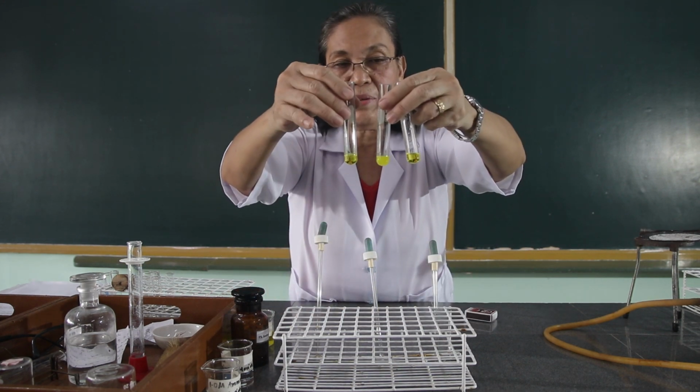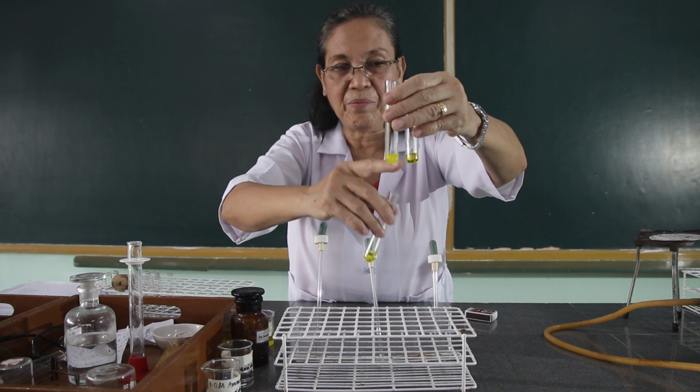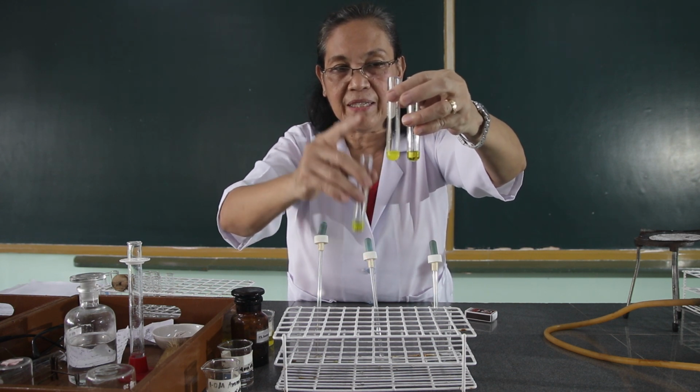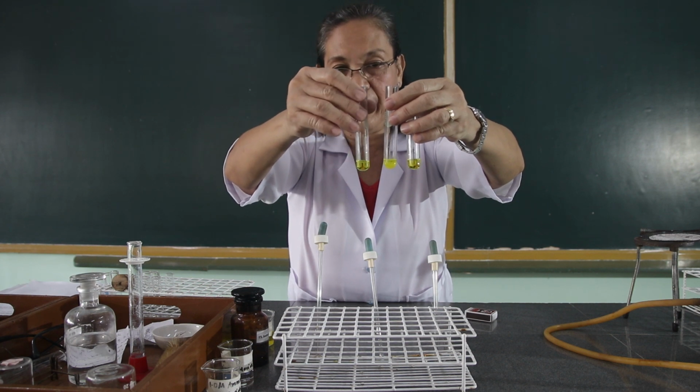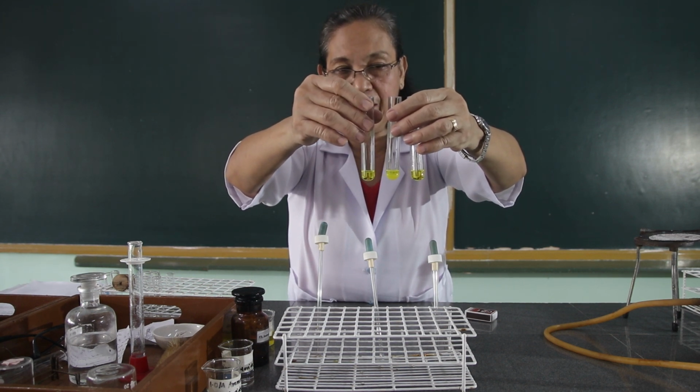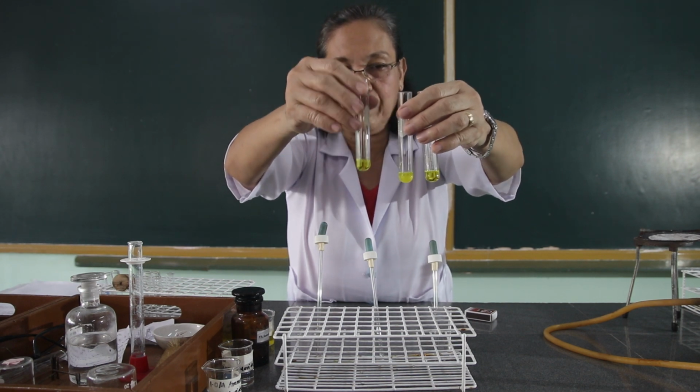I want you to observe what happens. The first tube is the sodium chloride. The second tube is the potassium chloride. And the third tube is the ammonium chloride added with picric acid. Okay, I want you to observe.